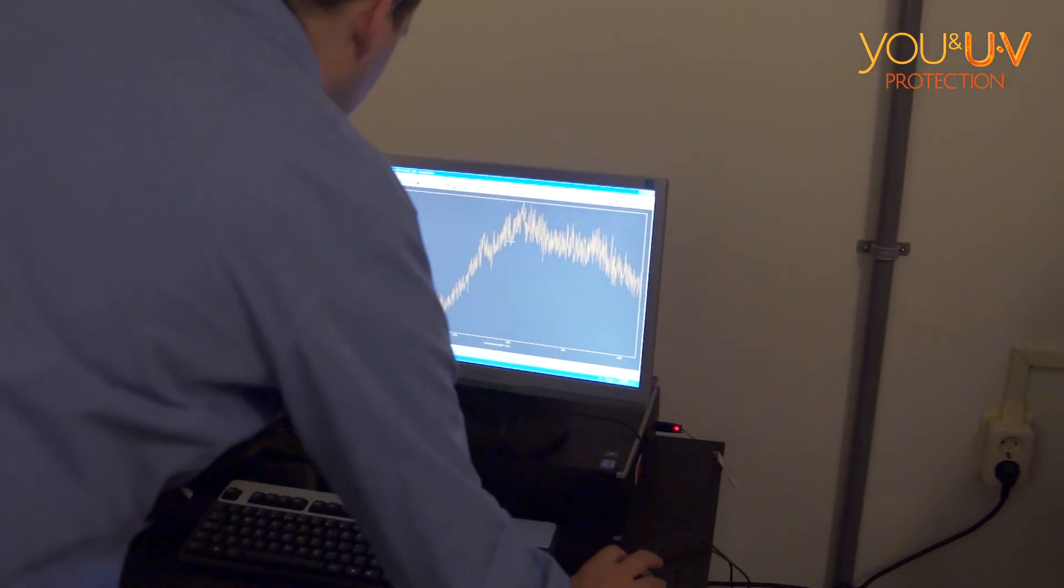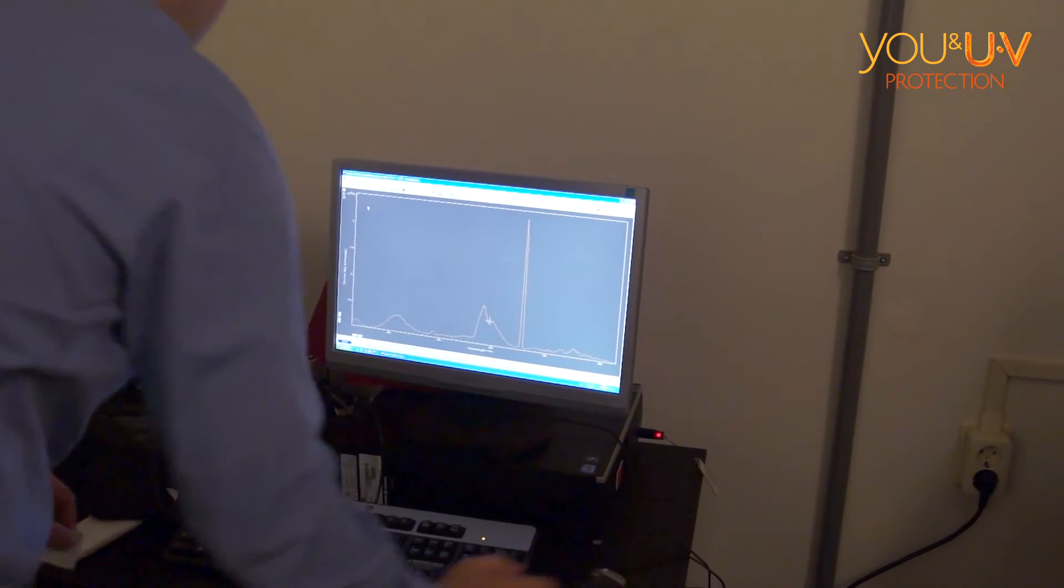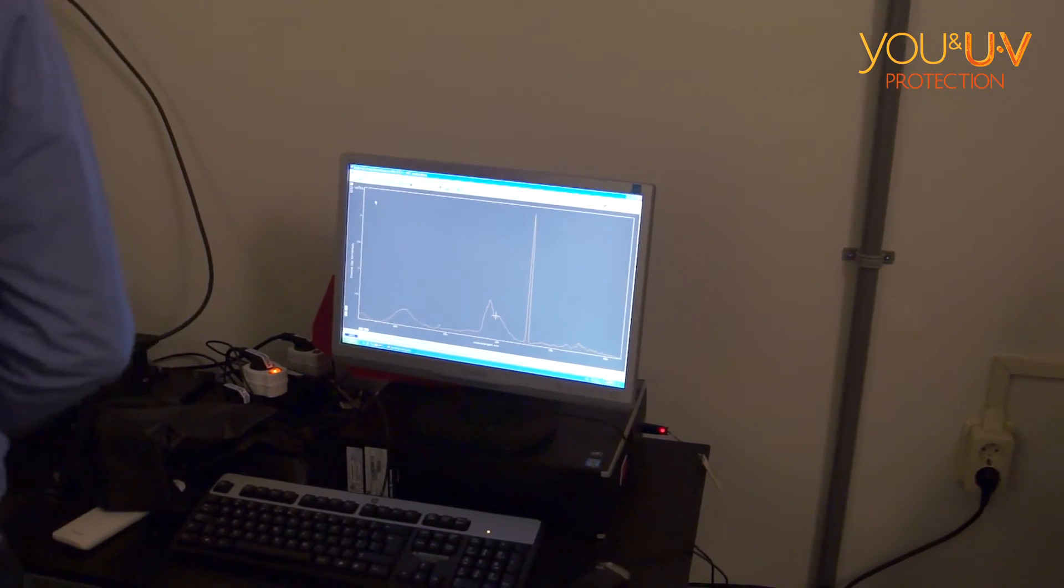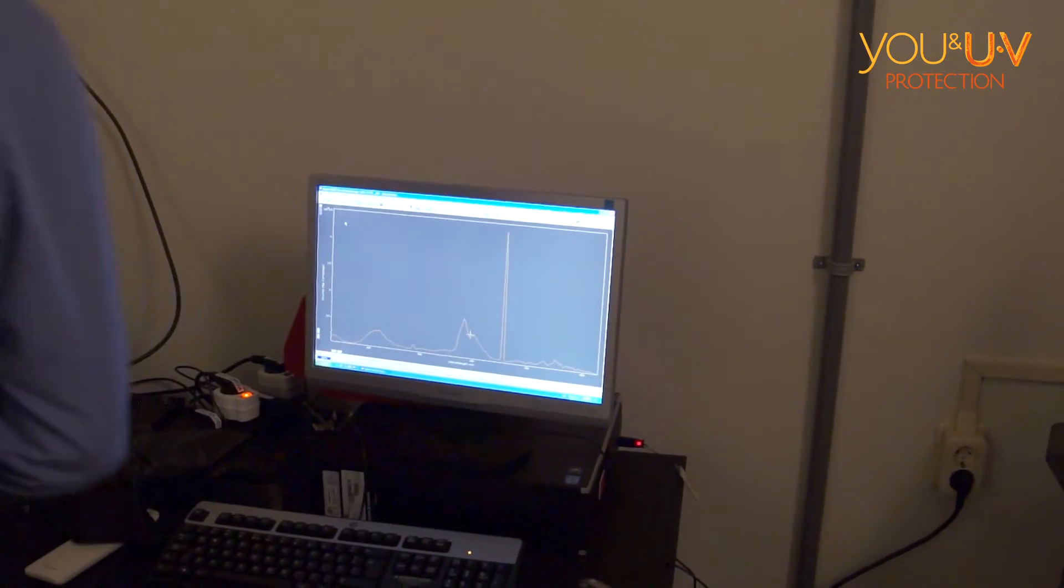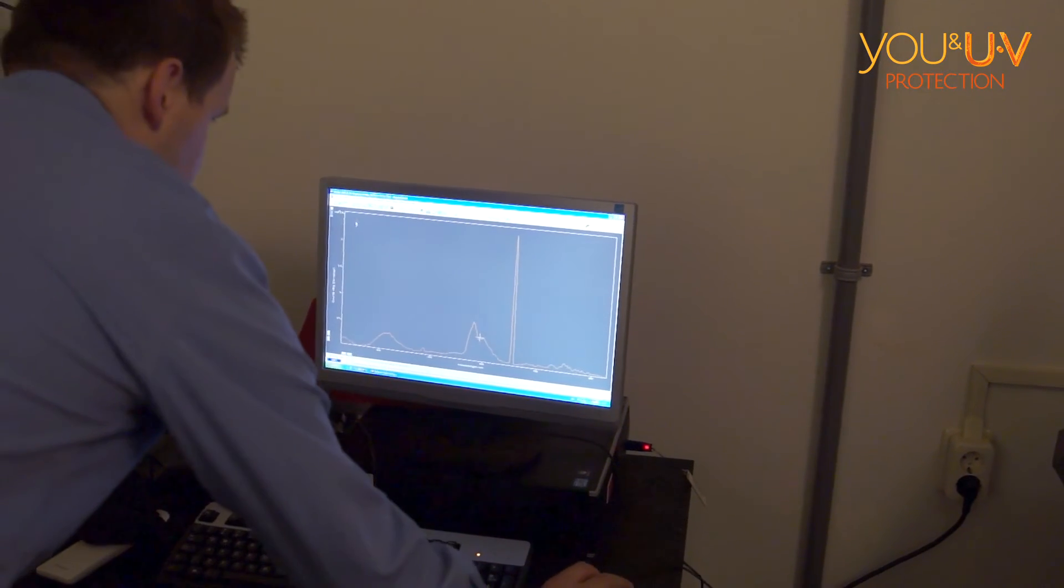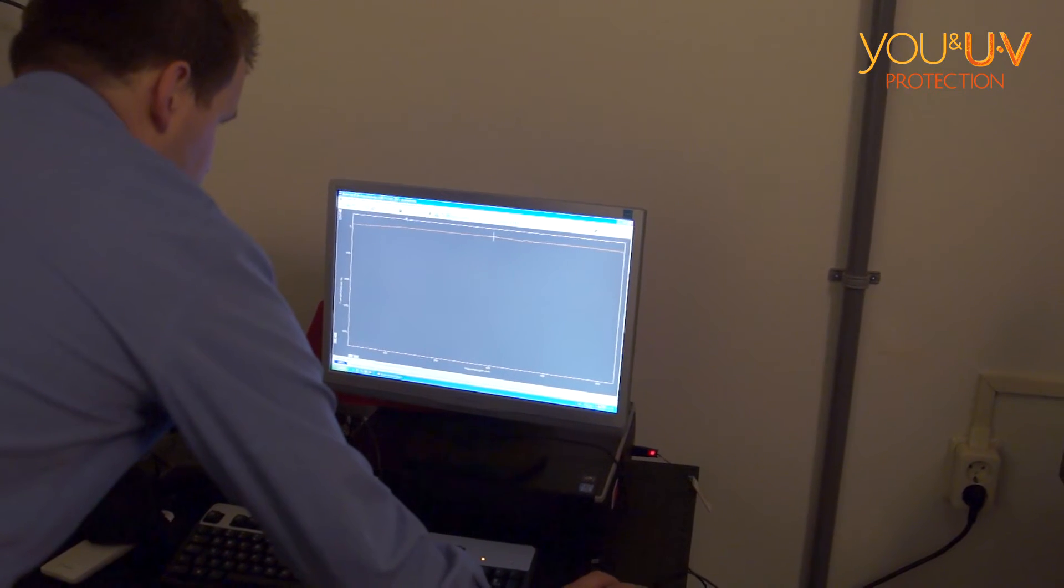Turn on the lamp. This is the spectrum with the lamp on. And then I want to measure with the cloth, and this is it.